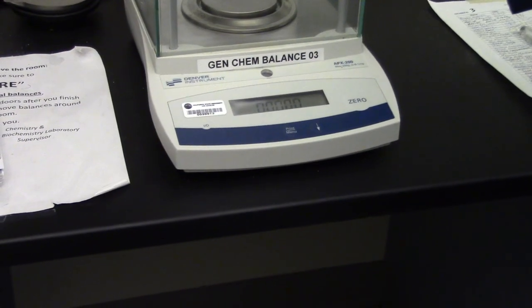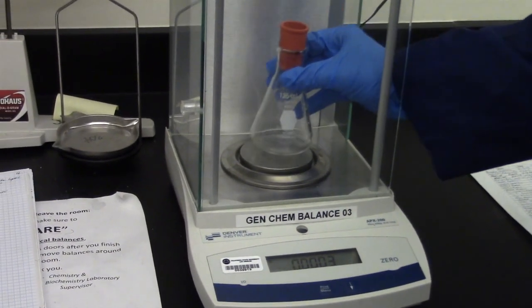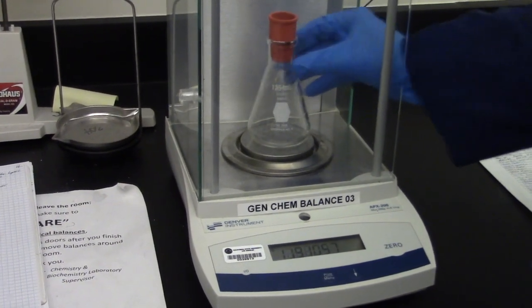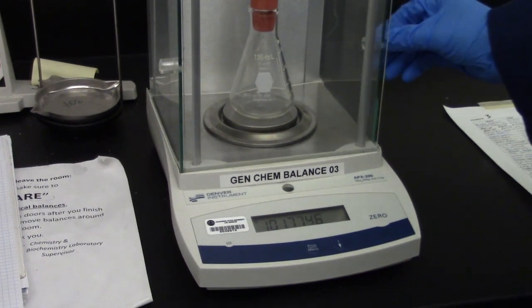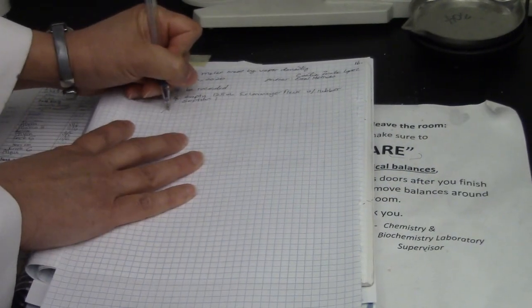Weigh a 125 milliliter Erlenmeyer flask with a rubber septum obtained from the stock room on an analytical balance. Record the mass.